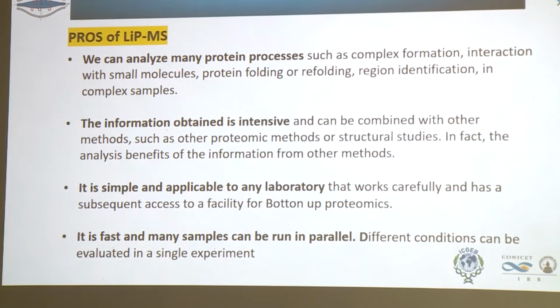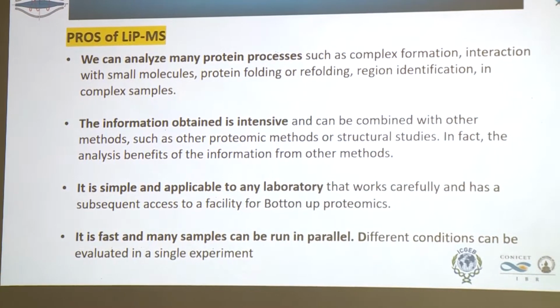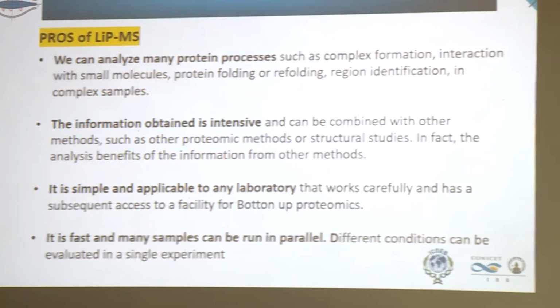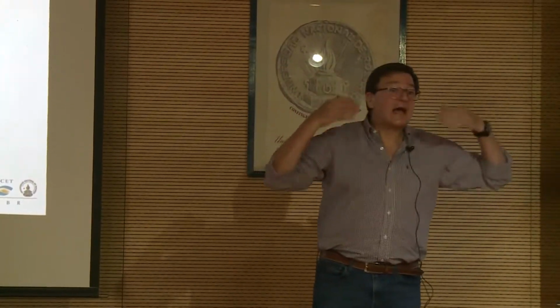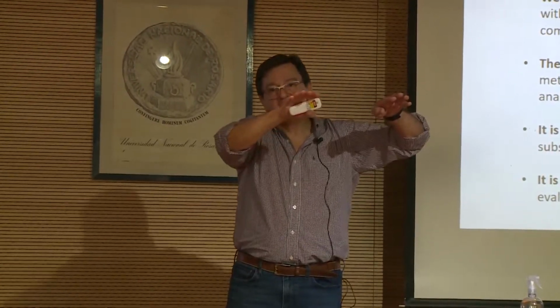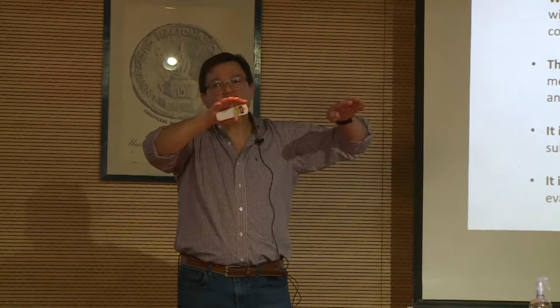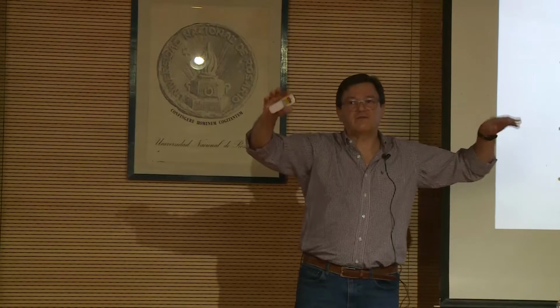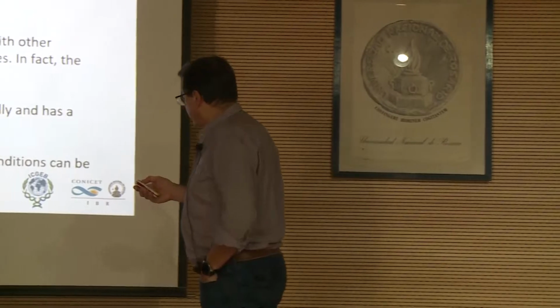For example, to vary your concentration of protease and the ratio of sample to protease, you can run 5 tubes at the same time, then analyze the peptides that you get, and you say, well, here we don't have any difference from the sample without treatment, we have some difference with number 3, and a good difference with number 4, but we lost the difference with number 5. So in one experiment you can get a lot of information.